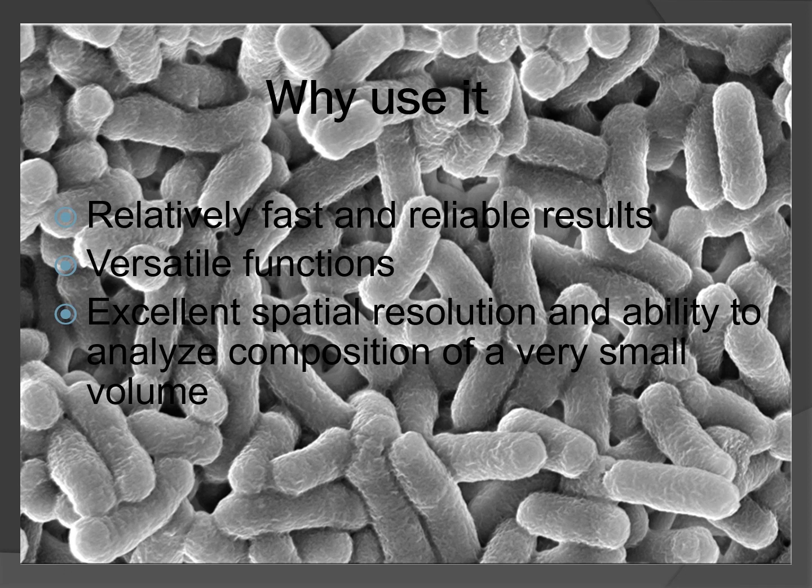Why use it? It is for relatively fast and reliable results, its versatile functions, excellent spatial resolution, and the ability to analyze the composition of a very small volume.